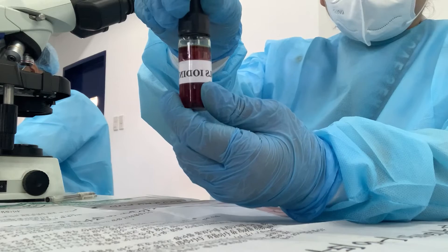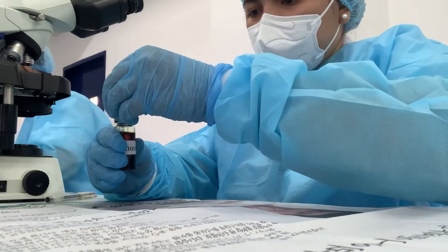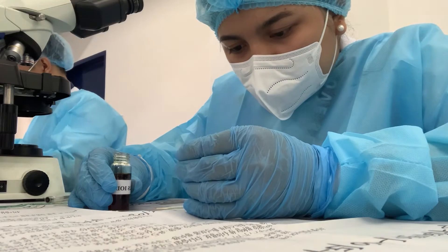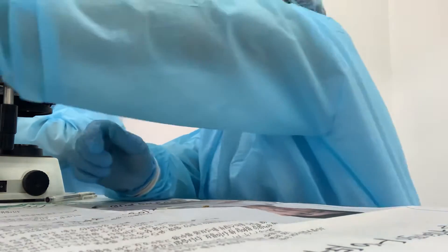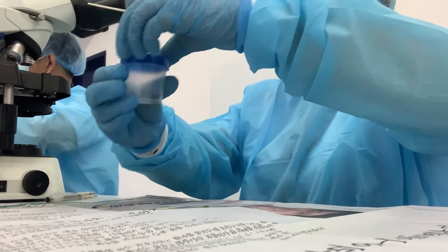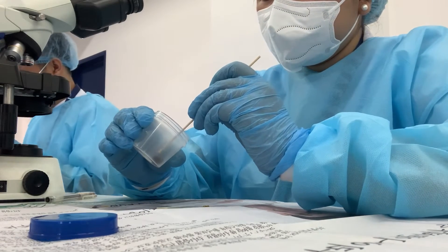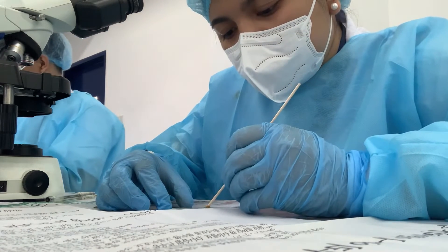Now, on the same glass slide, get a Lugol's iodine solution and place a drop on the center of the right half of the microscopic slide. Using a new and clean wooden applicator stick, pick up a small portion of the stool specimen, again with the size of a match head, and mix it with a drop of Lugol's iodine solution to form a suspension.